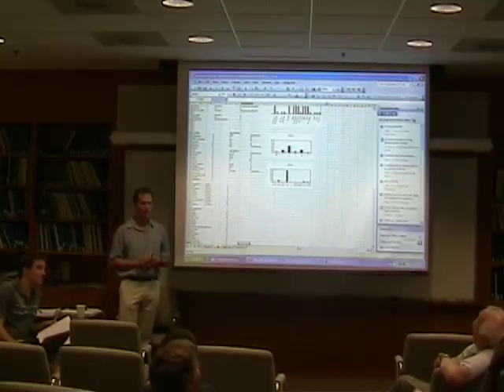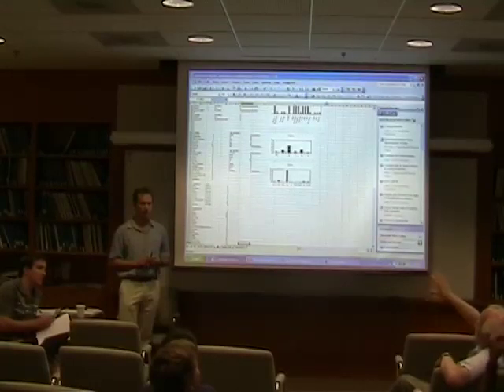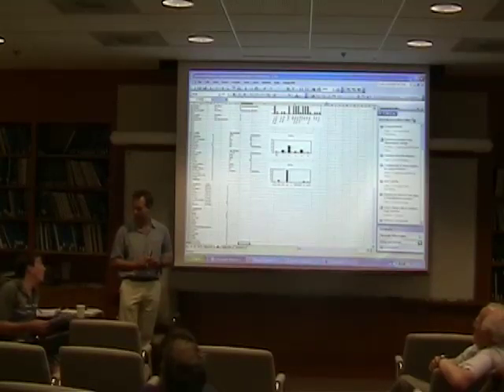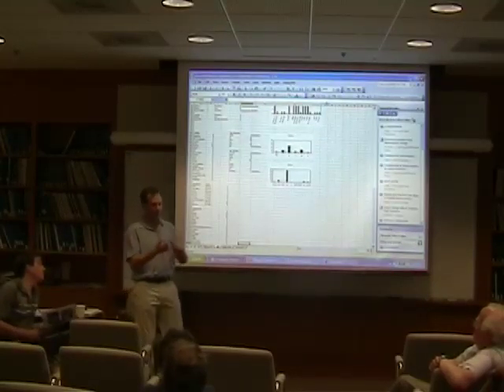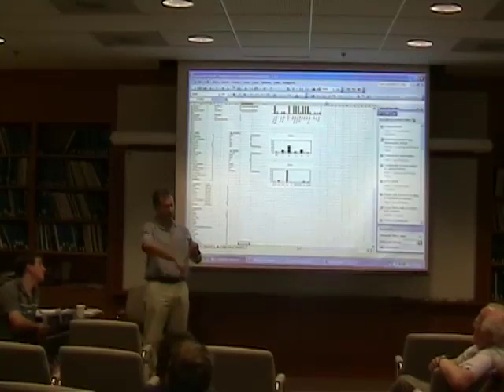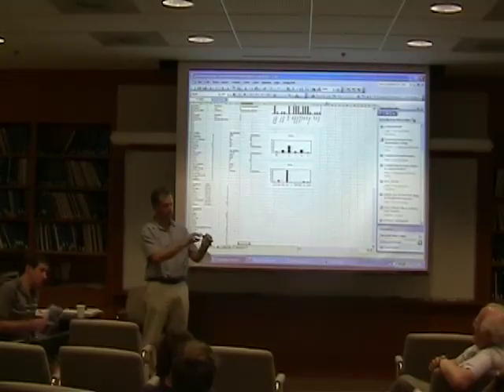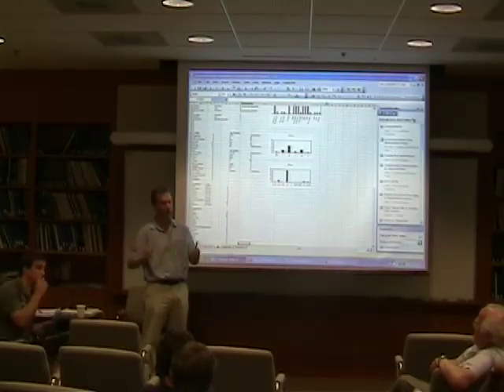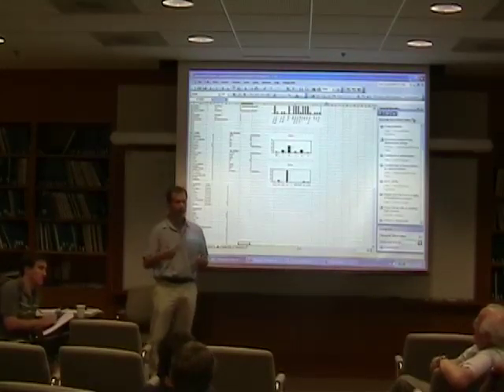I think so, but did you add a few things that weren't actually used, that didn't actually give success in the literature? Yes, in the Optimizer series. For example, we looked at the HLB values and the distribution and tried to take some at different points. We tried to take some ions at different points within the Optimizer series as well to try and sample differently, because people keep trying the same things over and over again. You stay in the same space, so we need to try things as well as the ones that are in the literature. They may not work, but at least we sample the space.